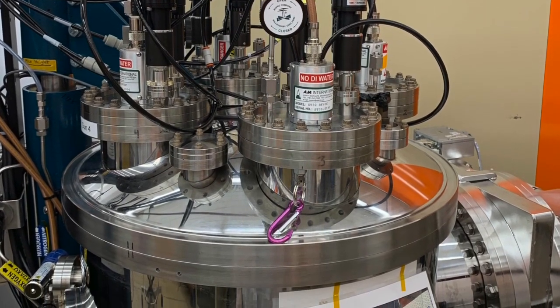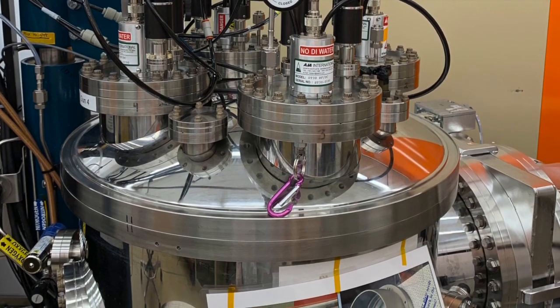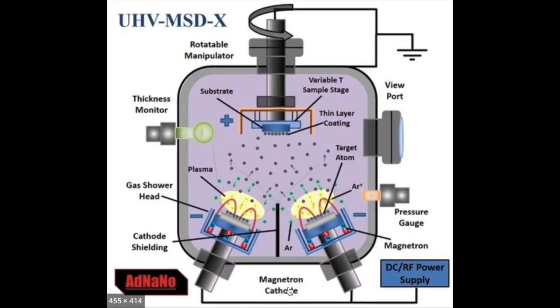So now we'll take a quick look at the sputtering system using a two-gun example. We have two guns on the bottom. They just as well could be on the top. It does not really matter. It's just a system configuration.